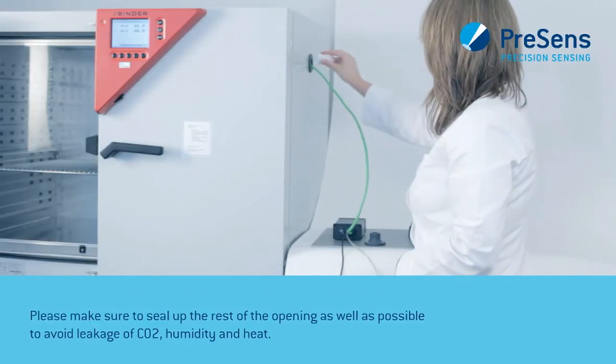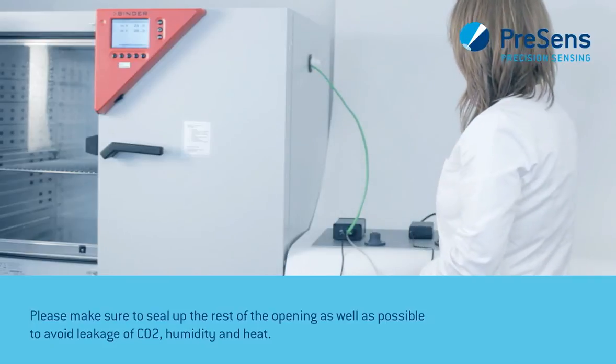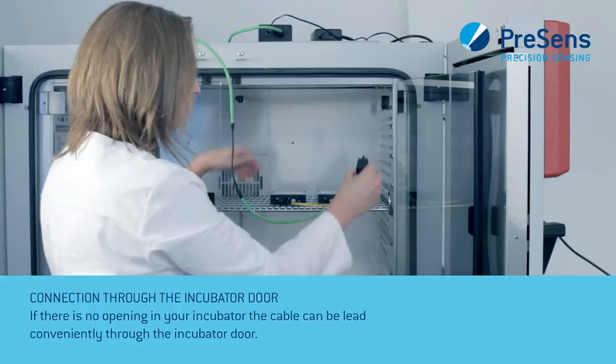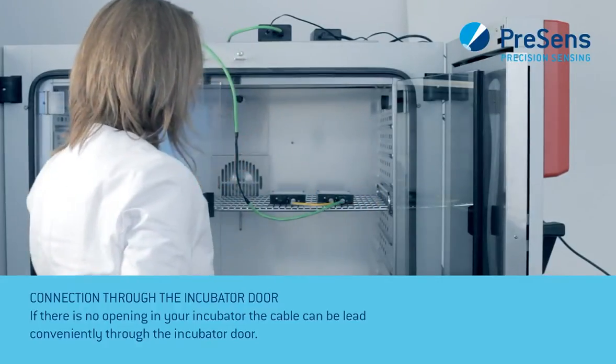Please make sure to seal up the rest of the opening as well as possible to avoid leakage of CO2, humidity, and heat. If there is no opening in your incubator, the cable can be led conveniently through the incubator door.